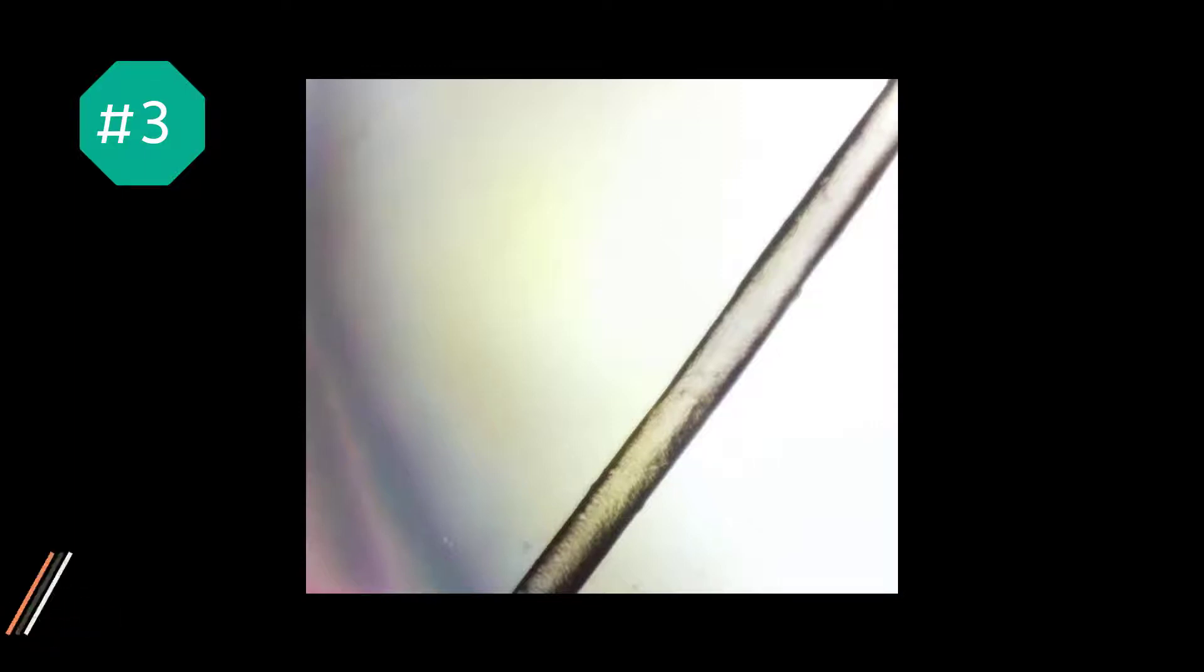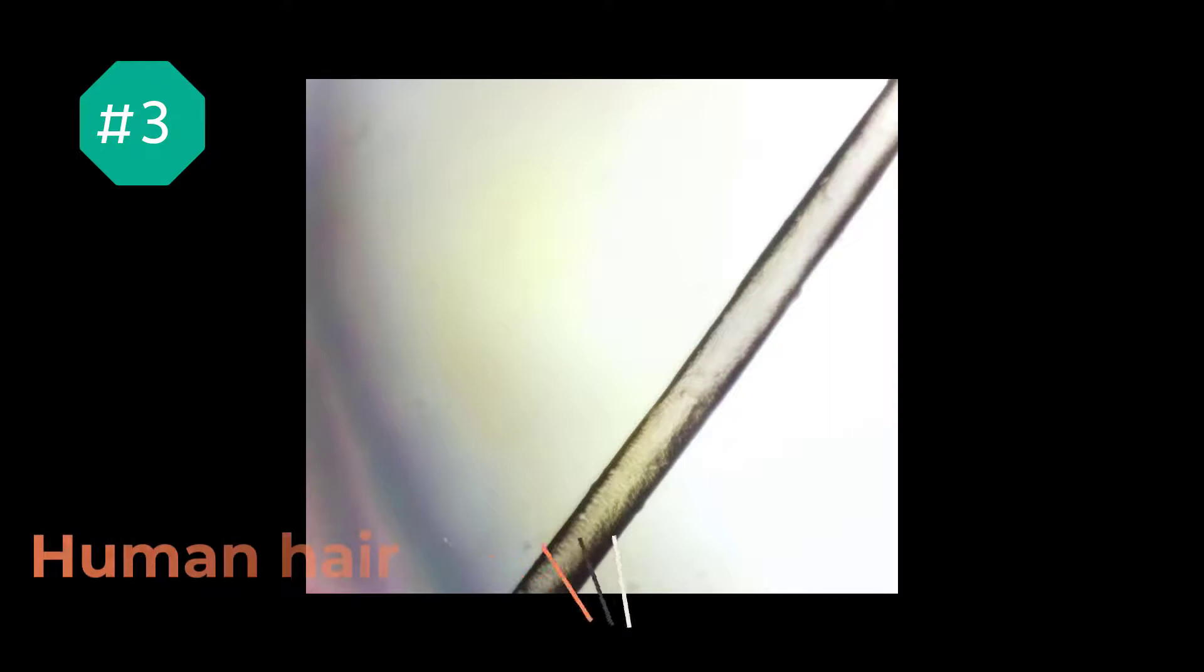Moving on to number three. Human hair. Mine, to be exact. A strand of blonde hair, to be even more precise. We can see that it is somewhat translucent, and we can just barely see that it's not perfectly smooth.